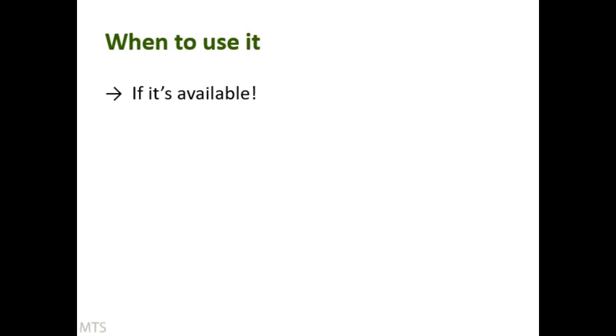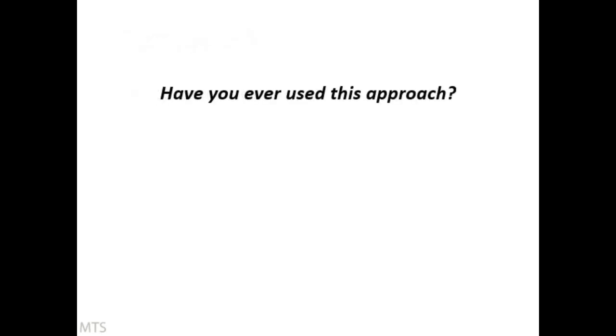So again, has anybody got access to this software and how to go with it? Mostly no's this time. And on most of the training courses that I run, that's what I find. So I tend to focus on the one factor at a time. And I think the beauty of one factor at a time is it does give you a really good understanding of how the method works. So hopefully then if you did get access to DOE and you did get access to computer modelling, you would be able to have a go and to use it. Okay, so nobody there has it.